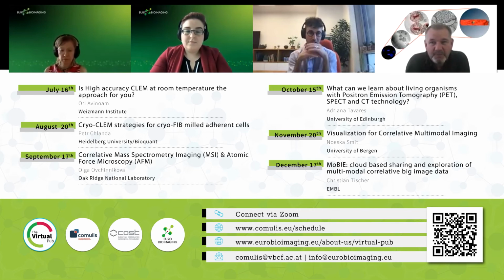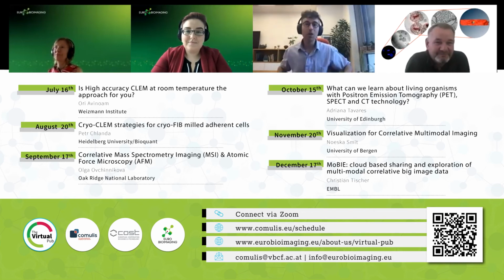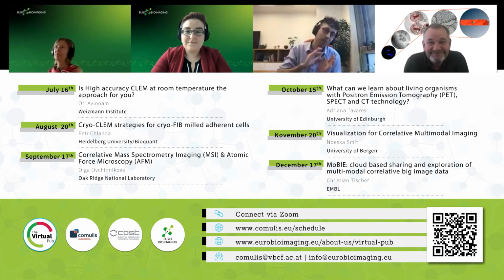Otherwise, generally, I would say, if your process is not too fast, you can probably live with fixing. The fastest I could do it, and I'm by far not the best model human, was about 20 seconds or so between grabbing it from the microscope, putting it on the slide and high pressure freezing it. Confidently and reproducibly. I've also managed to do slightly better and slightly worse.